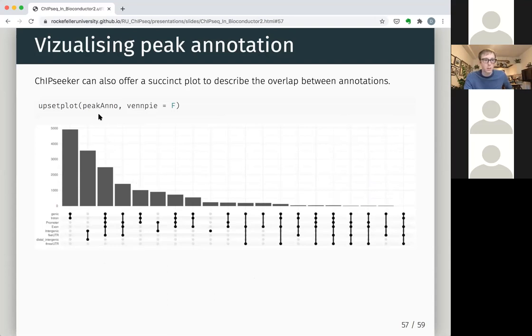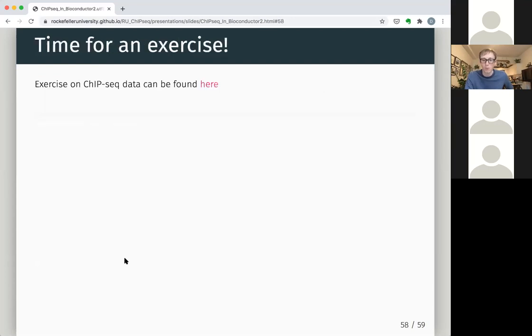And so, yeah, the ChIPseeker is just a nice package that allows you to really quickly, with just your GRanges, understand at a high level some places or annotations in genes that your peaks are falling near. And we'll move in this afternoon to try and understand how we can take that information and maybe get some statistical representation of overrepresentation or functional enrichments and stuff like that.